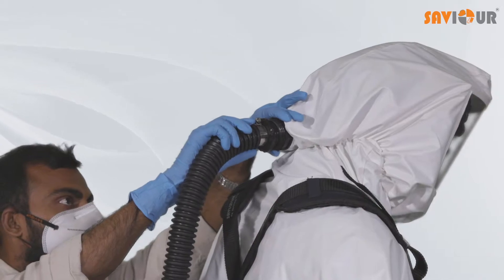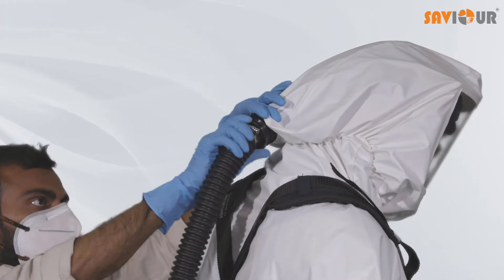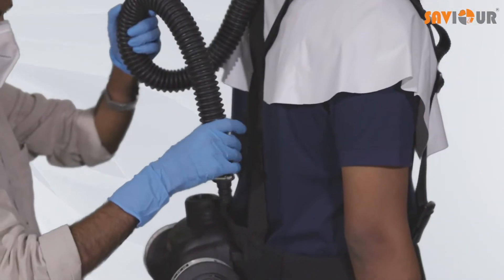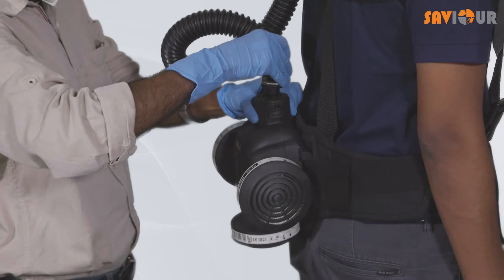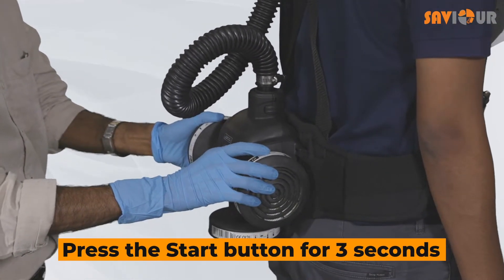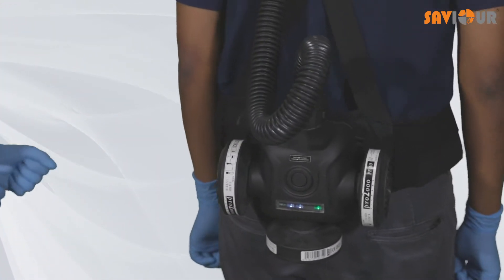Attach the hose to the input air connector provided on the rear of the hood, and connect the other end of the hose to the input air system. Press the start button for 3 seconds to switch on the input air system. This will start pumping air in the hood.